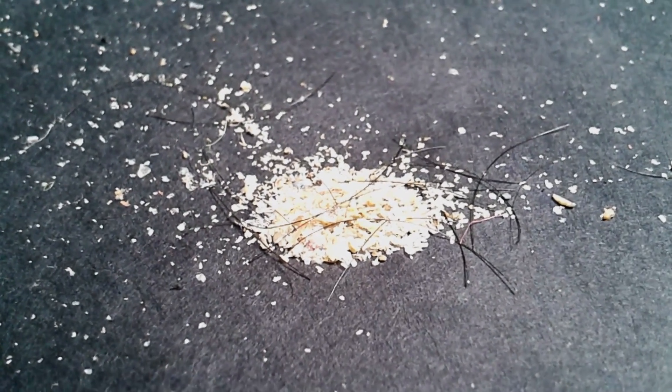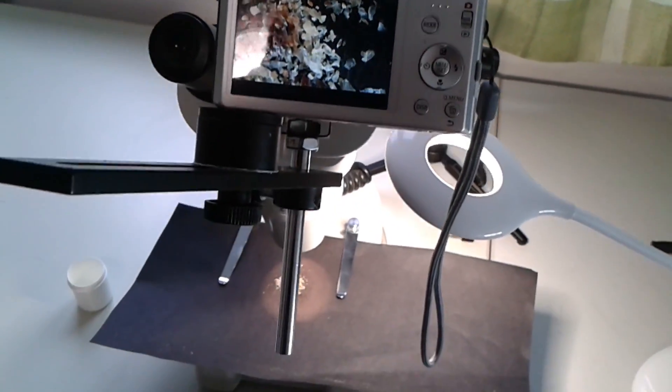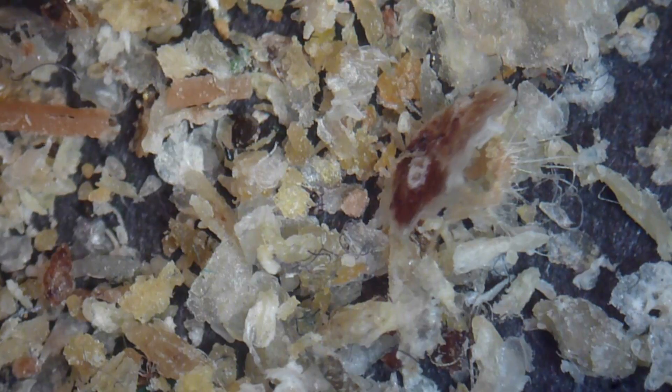There is occasionally also a little hair visible. This is everything nicely collected in the pile, and I've collected it on black paper so that it'll have a nice contrast. At 20 times magnification we can see the individual skin flakes — probably not only skin, but by far the most of it. I never eat beside my computer, so there are of course no breadcrumbs or food particles. The dandruff itself is actually the largest component of the dust that came from the keyboard. That's a very nice flake over there. The shape of the epithelium is quite clearly visible here — the flat cells which stick together.